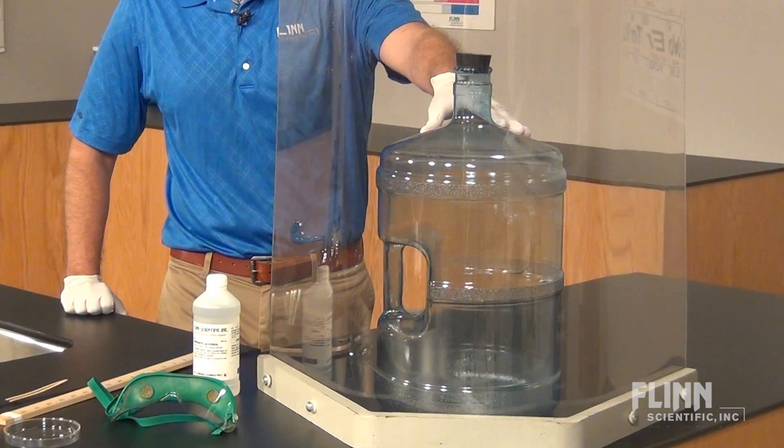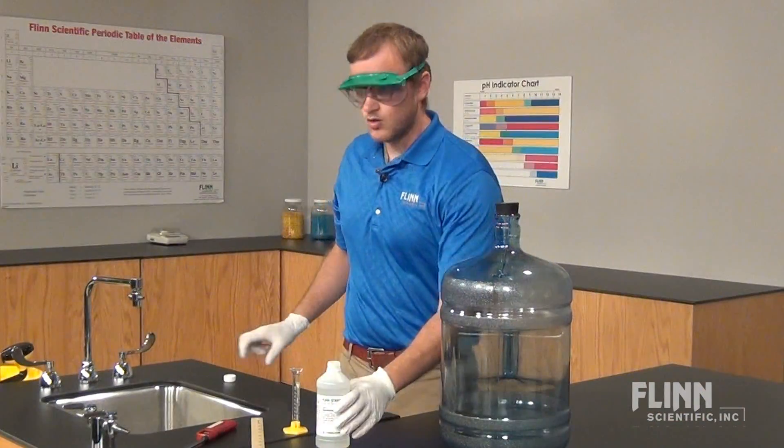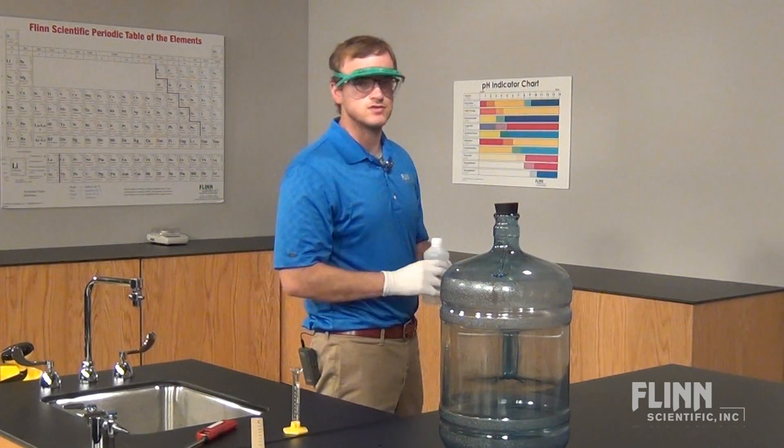Use only plastic bottles and routinely replace the bottle after about 20 uses. Always recap the alcohol bottle and move it far from the demonstration area. Never leave an open bottle of alcohol in the vicinity of the demonstration.